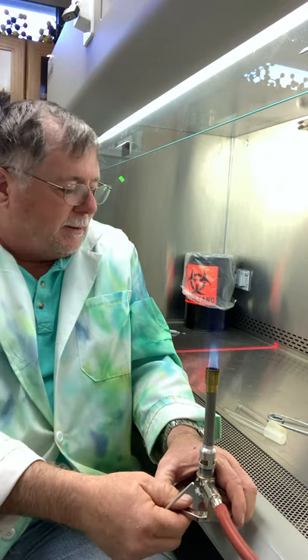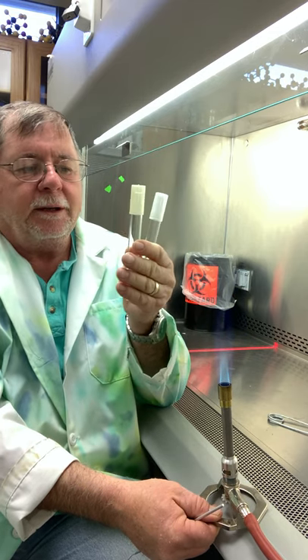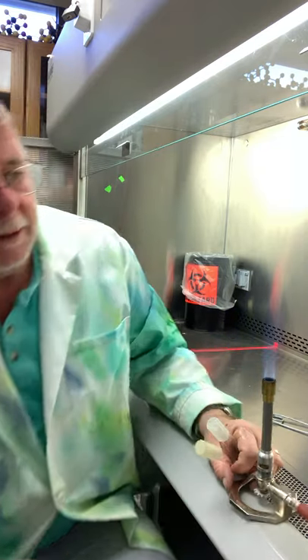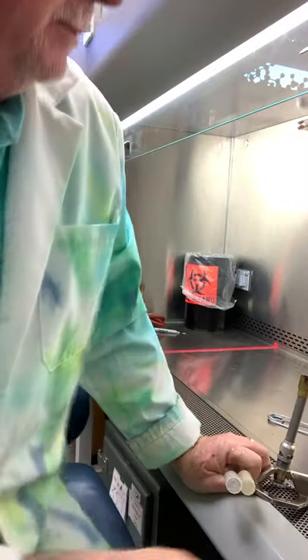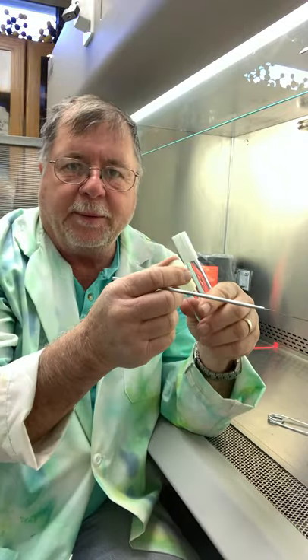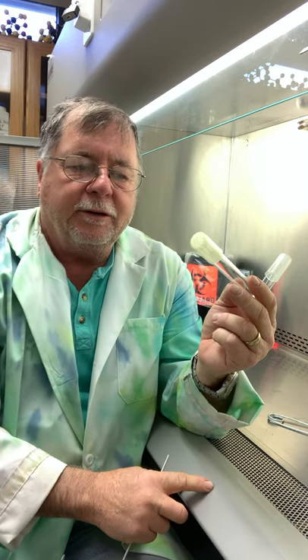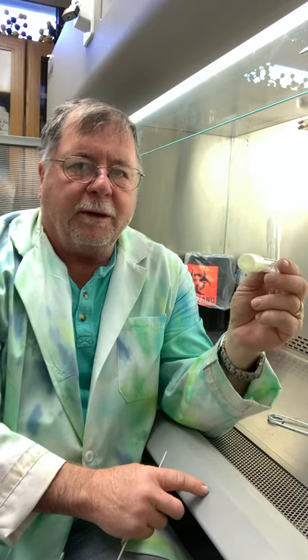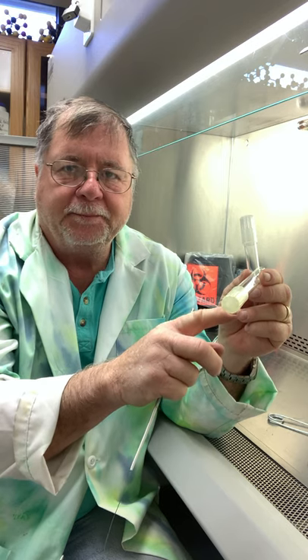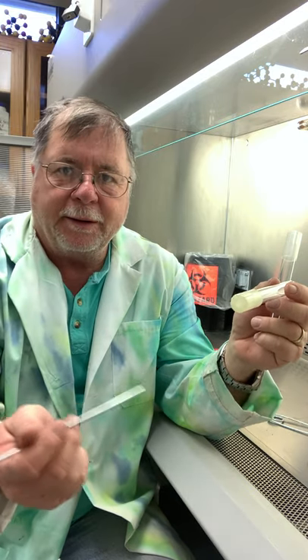All right, the other thing that we do is we have to heat our tubes like this. And so when we work with the tubes, we're going to take the slip cap off. So remember, this has an air vent in it so that it gives oxygen to the microbes. If you go beyond flat and tip it down a little bit, the fluid will run out of here. Okay, and then that means you've contaminated yourself and you've contaminated the microbes inside the tube.